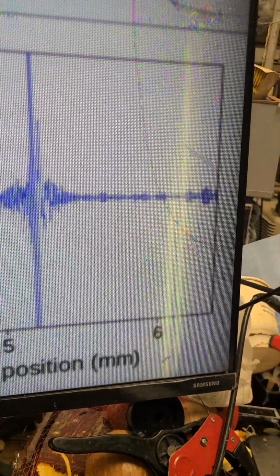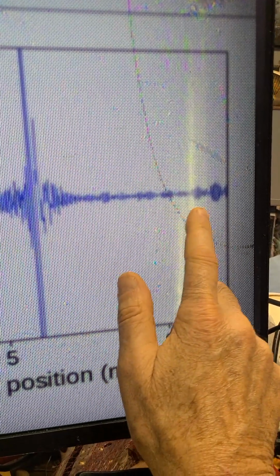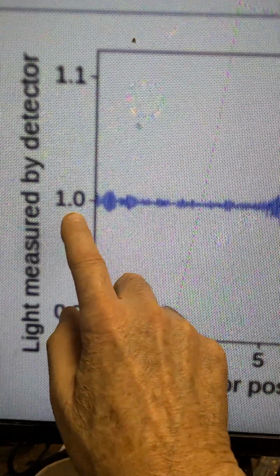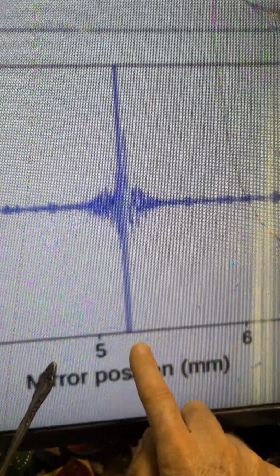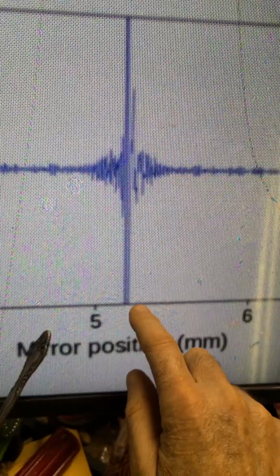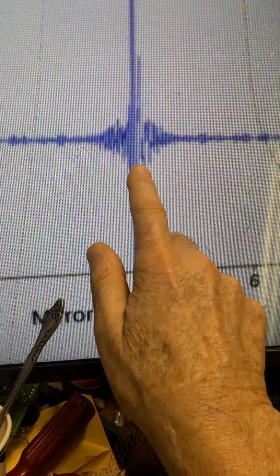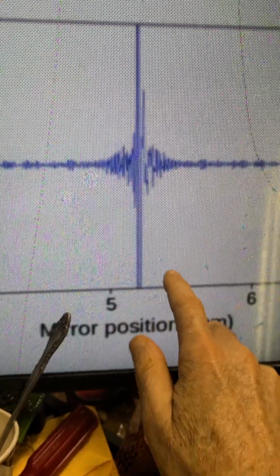And the baseline, where as we go out a millimeter or two, this constructive and destructive interference vanishes pretty much, and you get this baseline, which is actually happening at a mid brightness, as opposed to the high brightness up top and the more dark down below. And in the range of 1/10 of a millimeter or less, you're going to get the movement of 1/10 of a millimeter. You get the wide spike up and down.